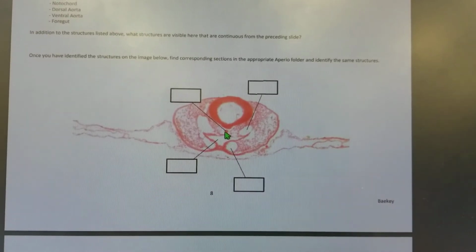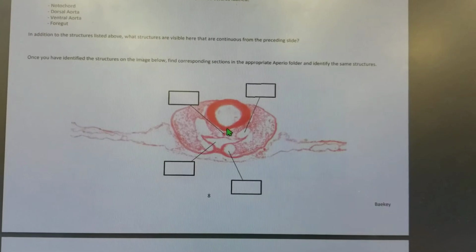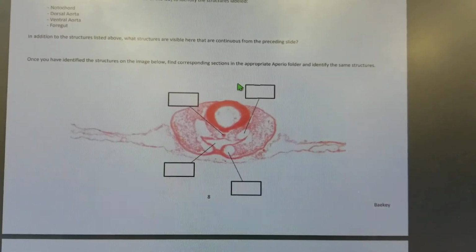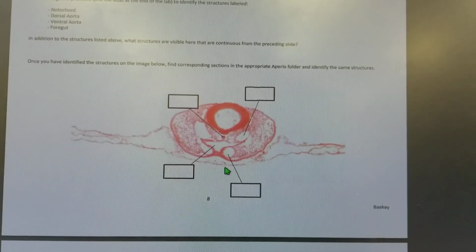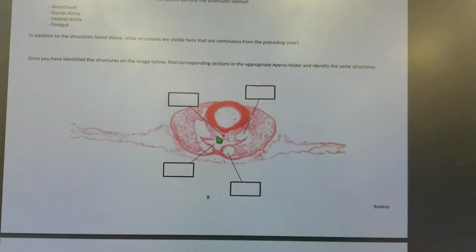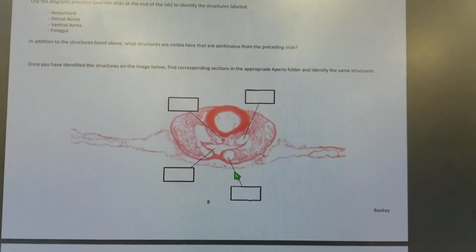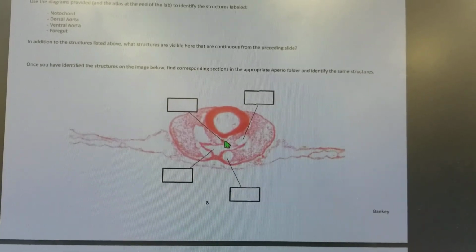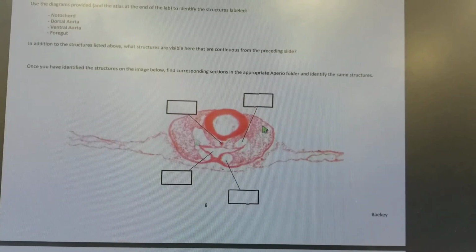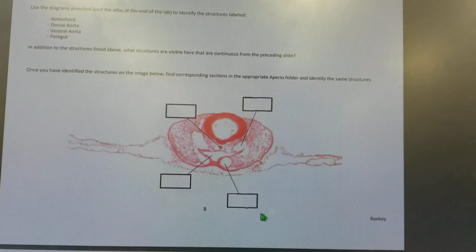And then here we have one of our landmarks right there. That's the notochord. And the notochord is important because it gives rise to the dorsal and ventral orientation of the developing embryo. So with this, and with your previous information, you now have the three axes to define the tissues within the embryo. You have a cranial to caudal axis, a left to right axis, and now a dorsal and ventral axis.